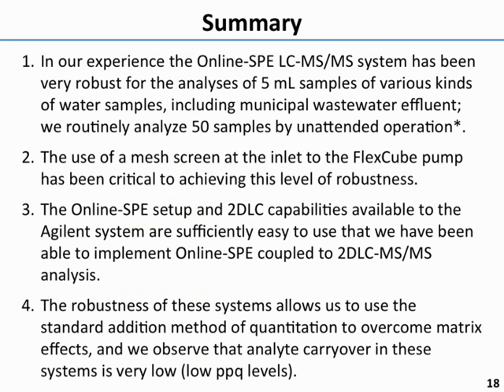So in our experience, this online SPE system as a front end to whatever kind of detection, or front end to a 2DLC system, is very, very robust. We're very pleased. We routinely run it overnight now, so we'll walk up to the instrument with, in our case, 10 samples, and then run replicates on those overnight. Again, getting back to this question of how many samples you can do, 50 with basically unattended operation, except for walking up with new sets of 10 samples, is pretty routine for us.